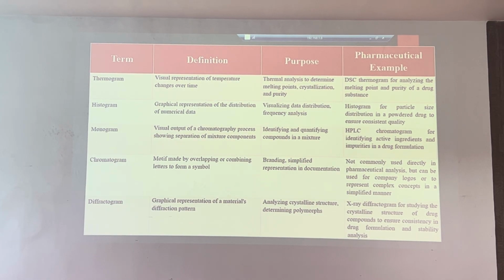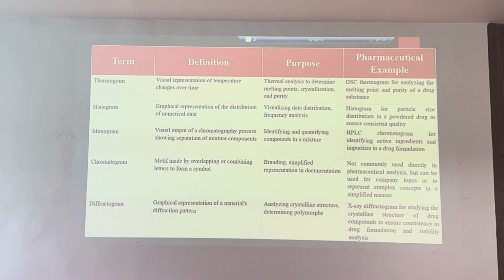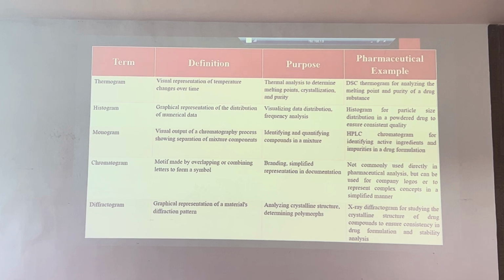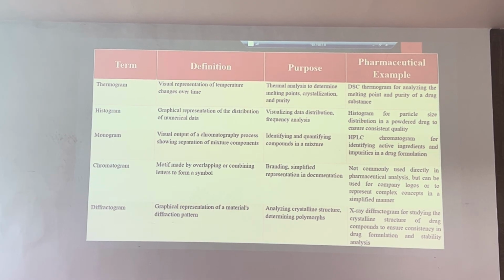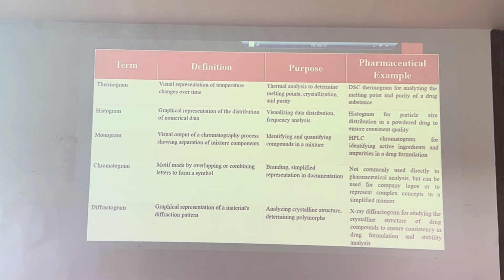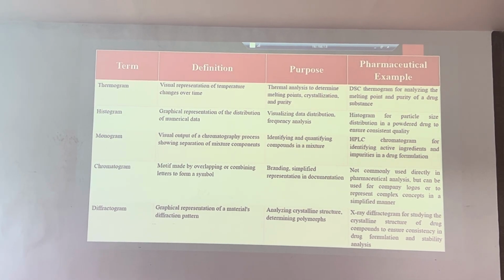So how does DSC basically work? One is a temperature program and the second one is time. Based on the time interval, the temperature will increase and you will get the graph, onset value, peak value, whatever you are getting. And the second, histogram.